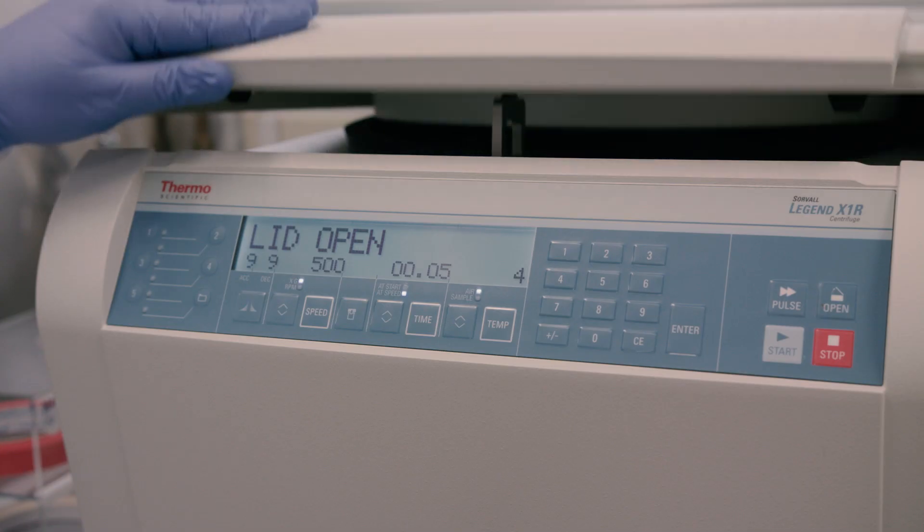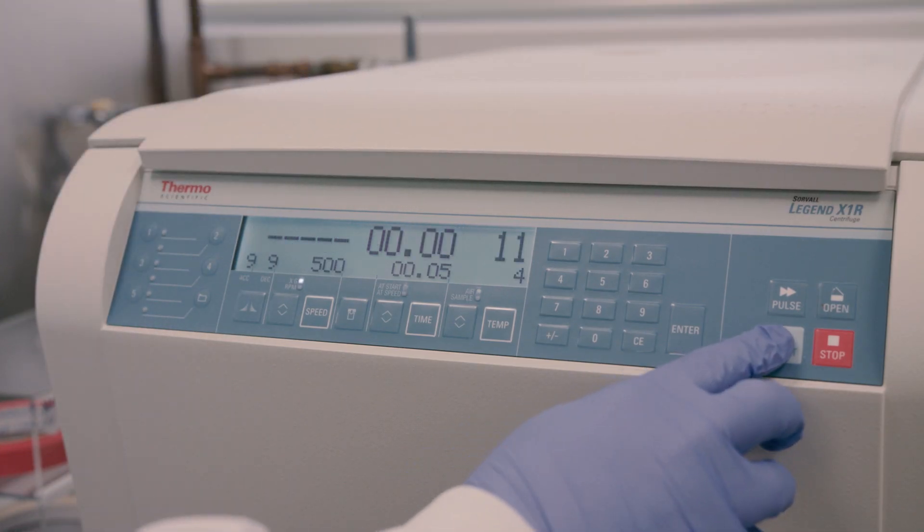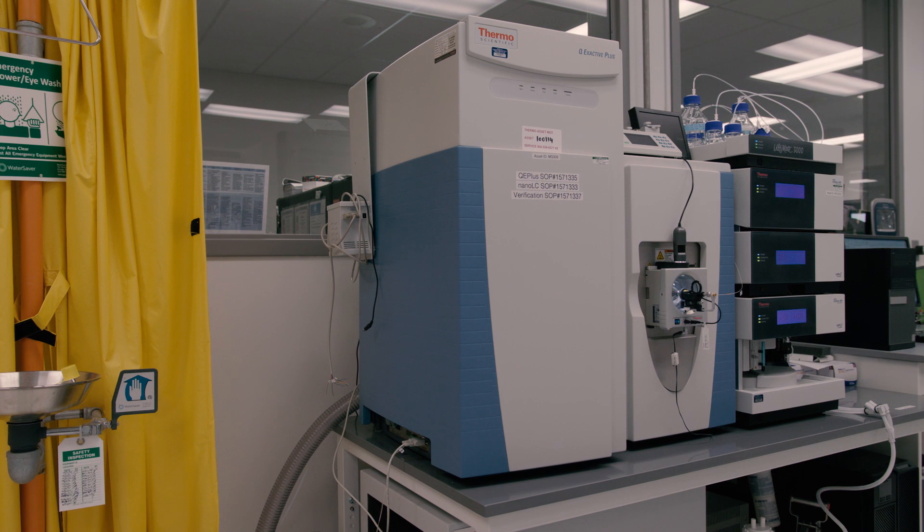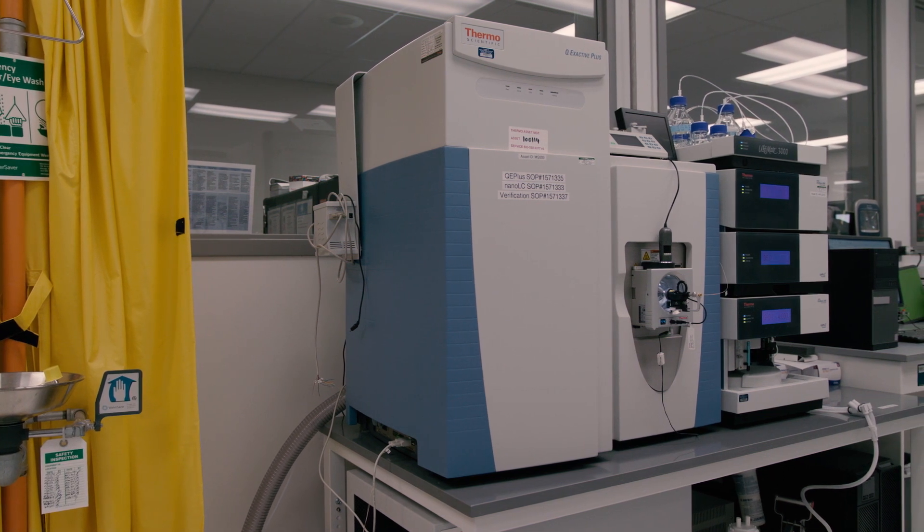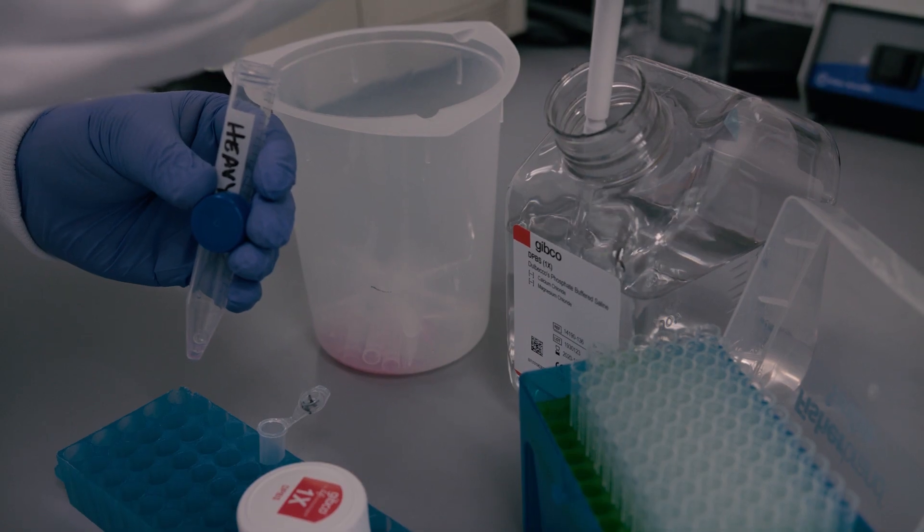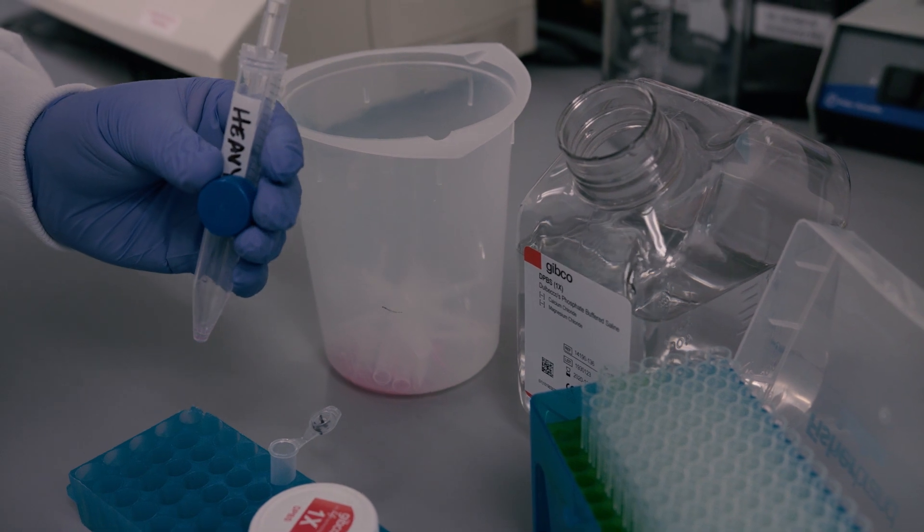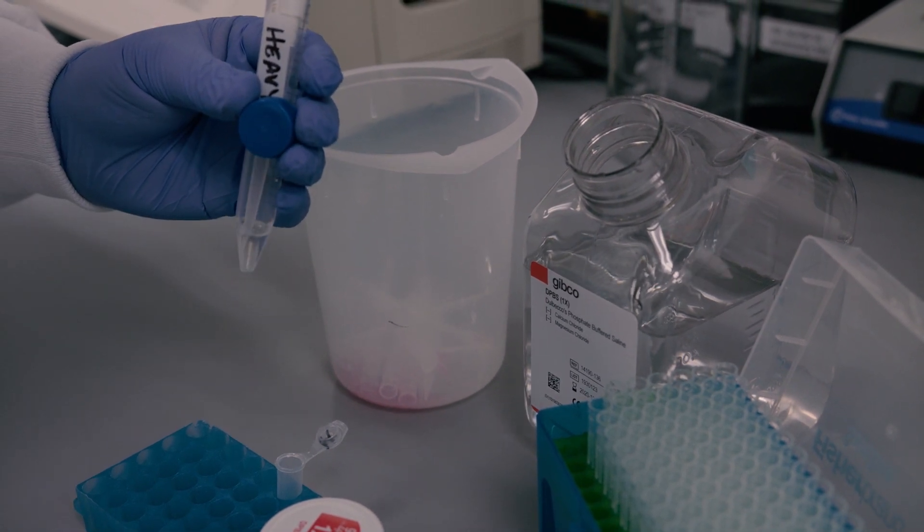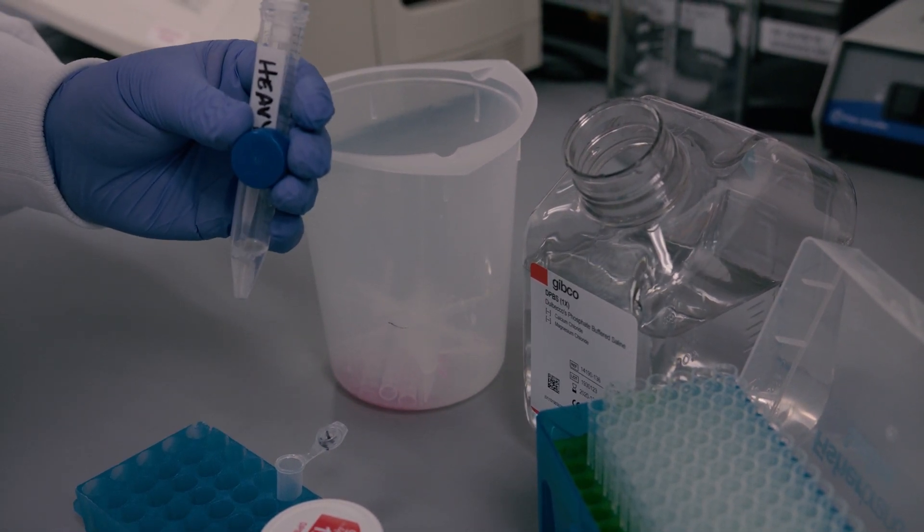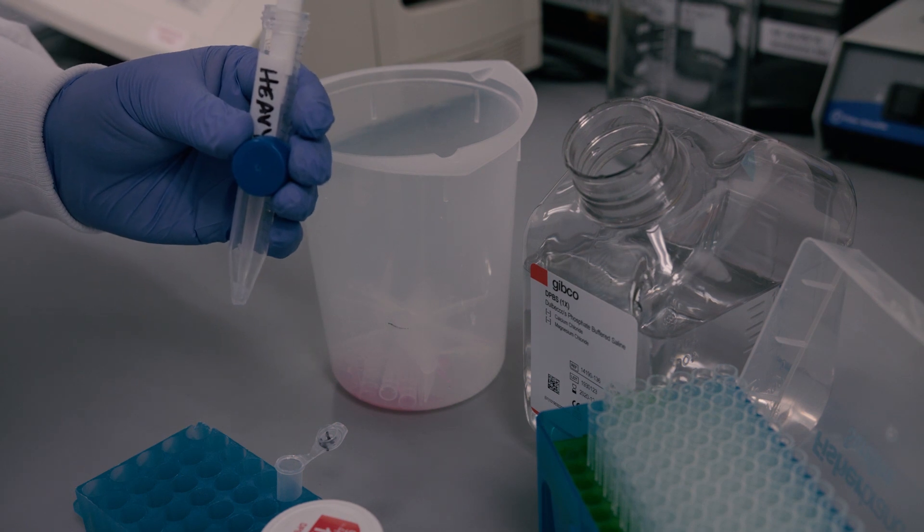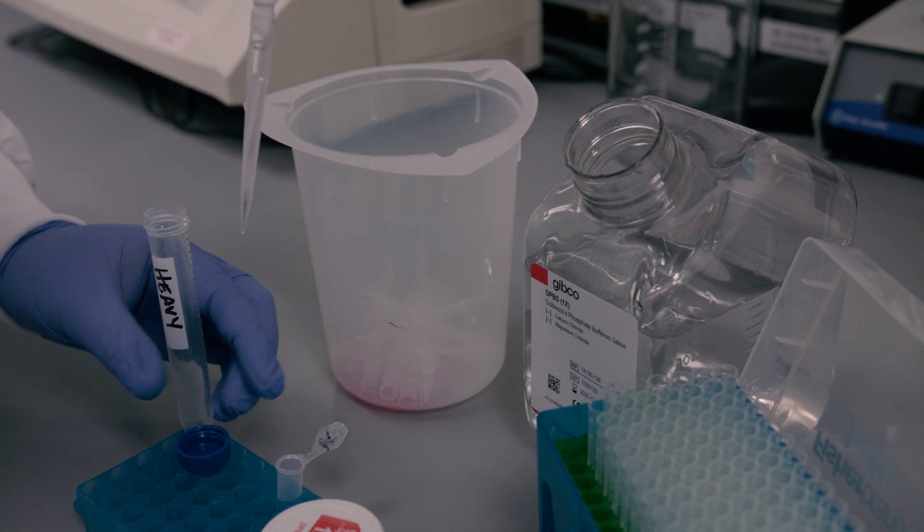The efficiency of isotope incorporation is determined by liquid chromatography mass spectrometry analysis of the samples labeled with heavy SILAC or NeuCode amino acids. Standard in-solution or in-gel sample preparation techniques can be used to extract, reduce, and alkylate cellular proteins before enzymatic digestion with Lys-C protease or trypsin protease to generate peptides.